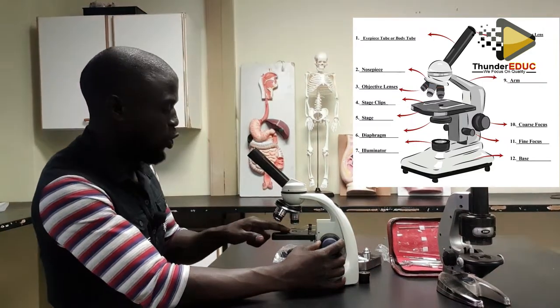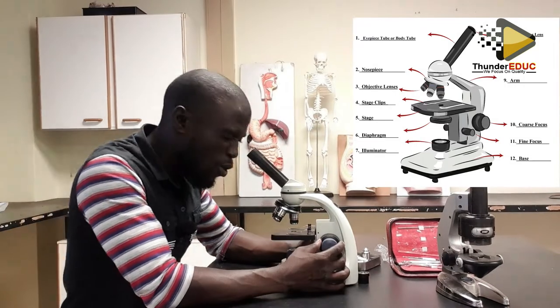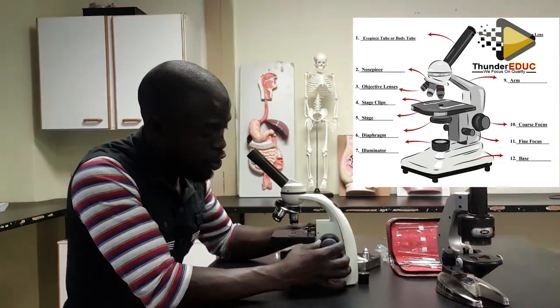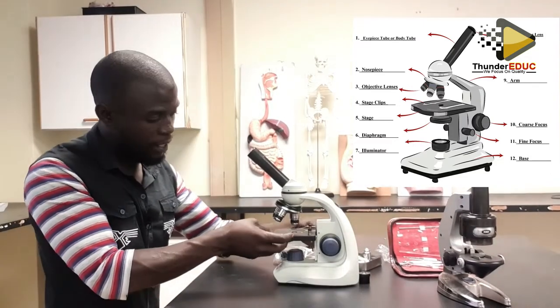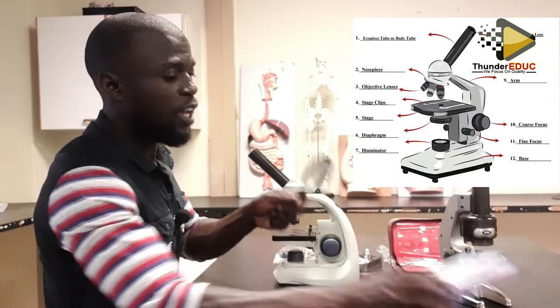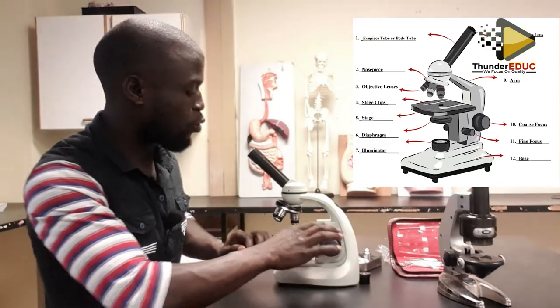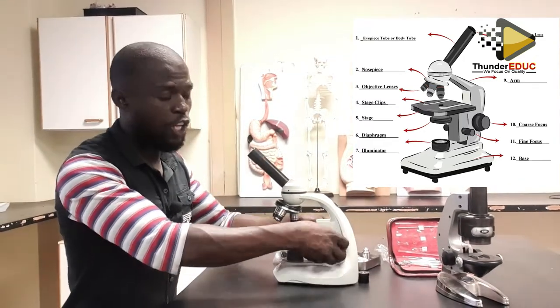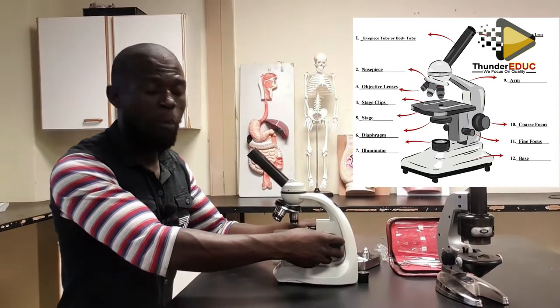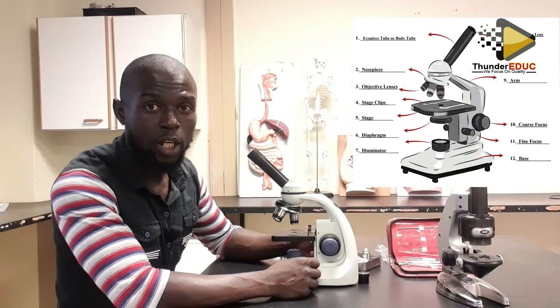For example, you have put the slide here on top, and now you are viewing. As you move this, the stage moves up and down. Remember, when you are using this, you try to move in and out so that you bring the correct focus. In this case, we don't have that here. We have to change using the coarse adjustment knob, and then the focus will be brought about. So we call it the coarse adjustment knob.